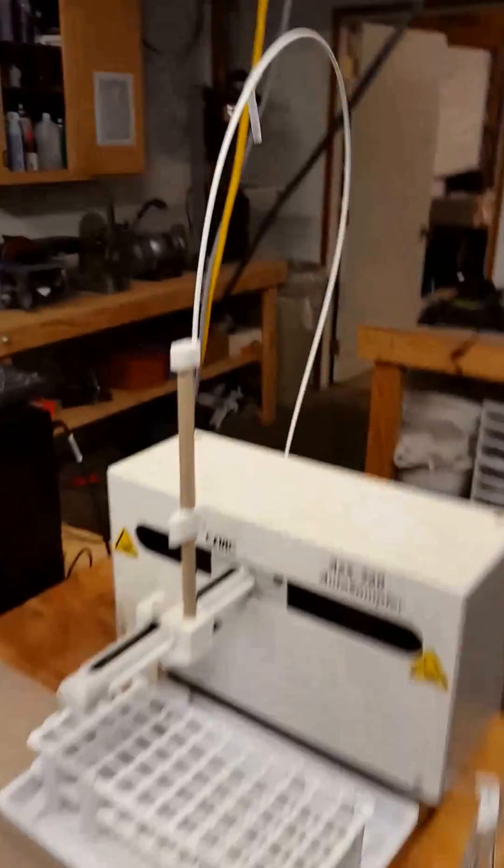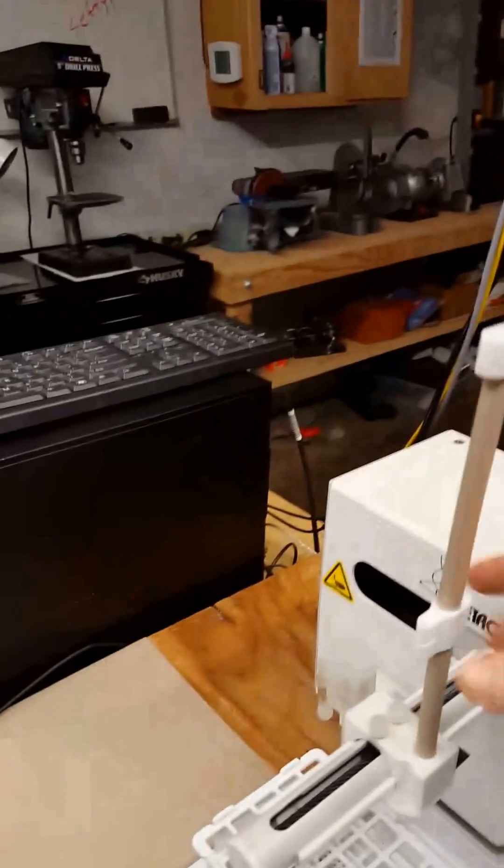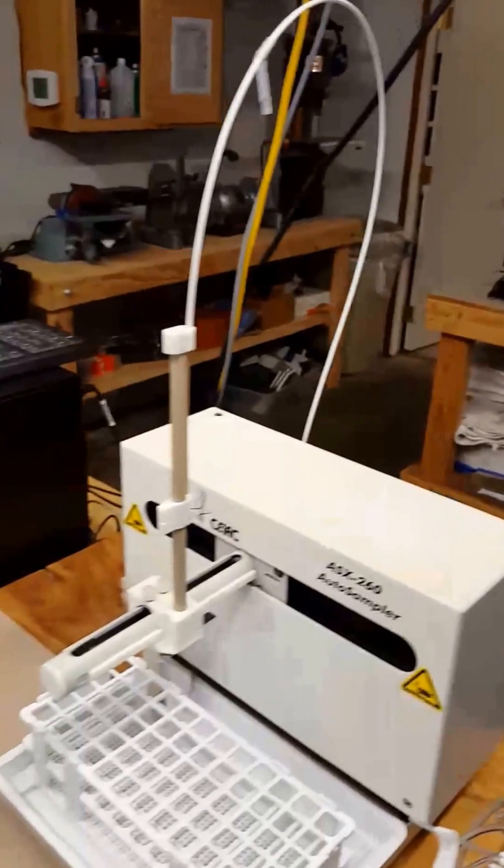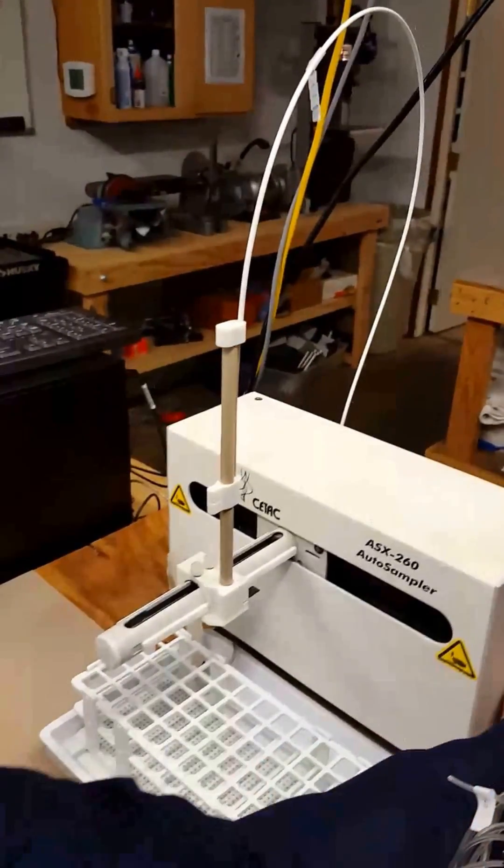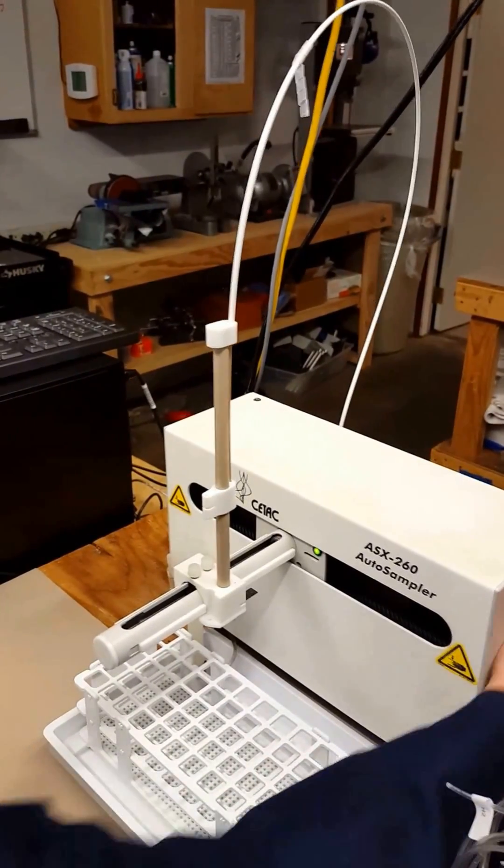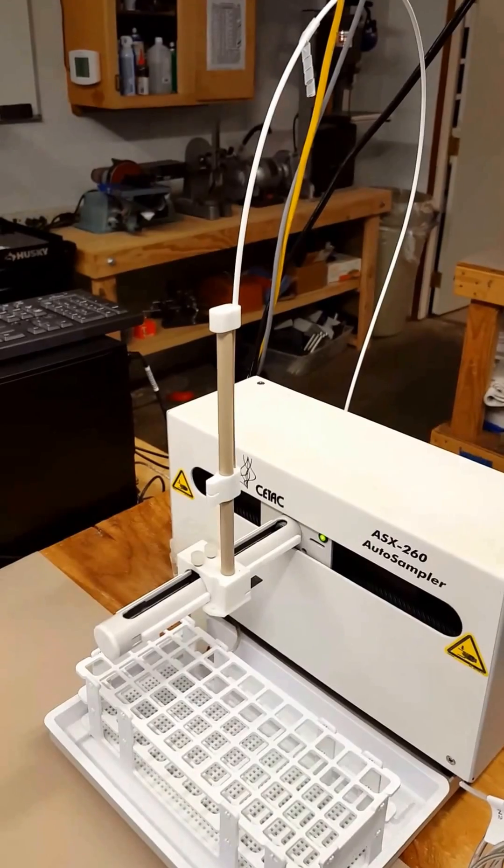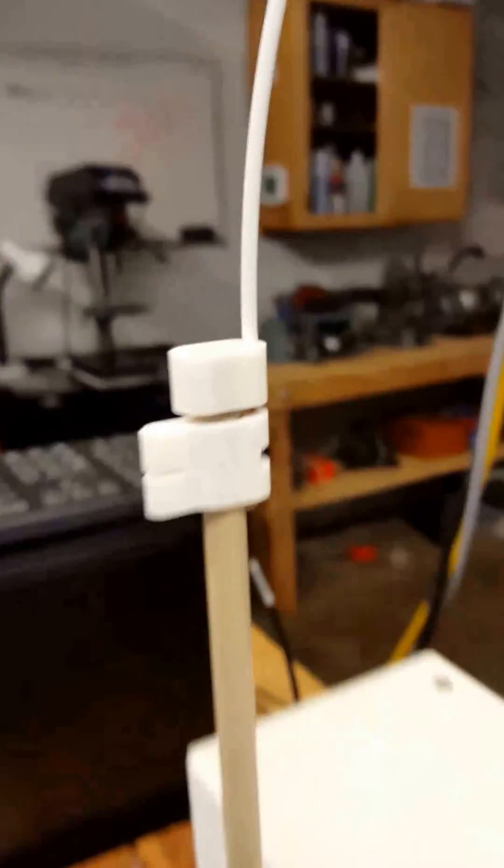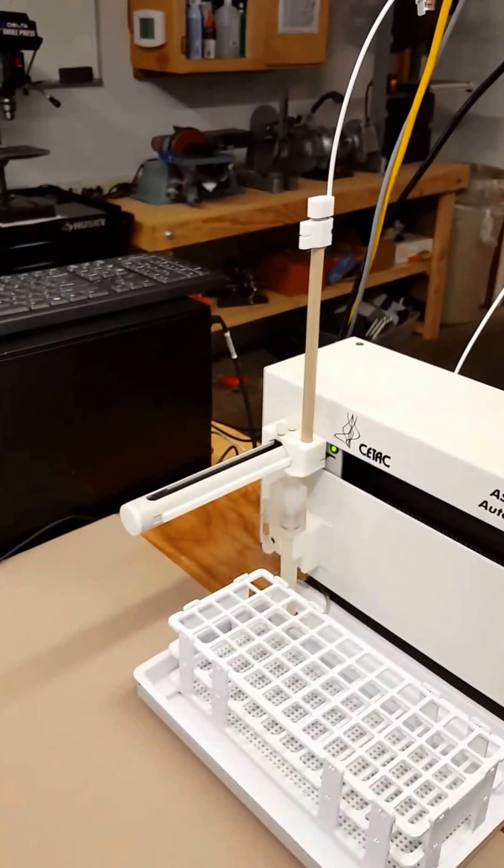First, after installing the probe arm assembly and adjusting the wheel in the back, turn the power on. You'll notice the probe arm assembly goes to the home position with a gap of one to three millimeters. Once that's set up, proceed to feed the probe.